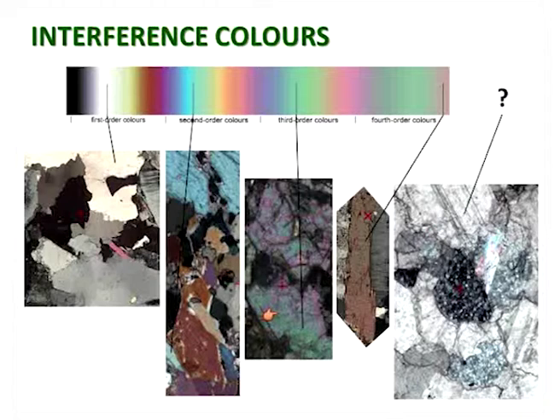And this maximum color here shows you a kind of almost typical third order in that you haven't really got any colors there except just a sort of purple and a green. So you're really just looking at that sort of straddling part of the third order, running from purple to green. That's all you've got in there. So that's in third order.